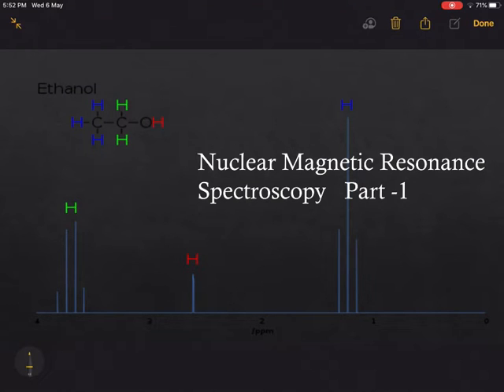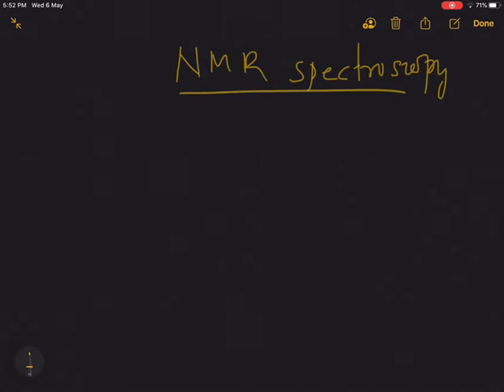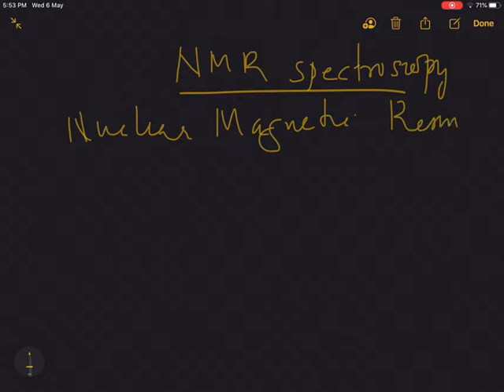Good morning all. Today's video lecture is on the topic NMR spectroscopy, or nuclear magnetic resonance spectroscopy. The most well-known application of NMR is MRI scanning, magnetic resonance imaging.